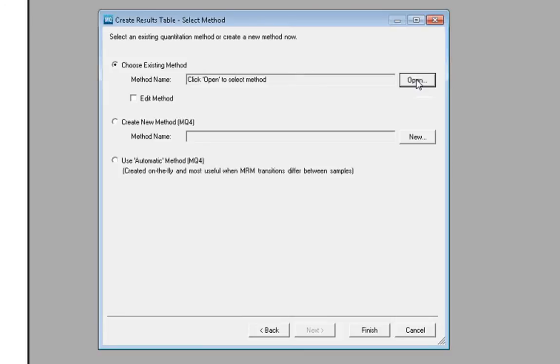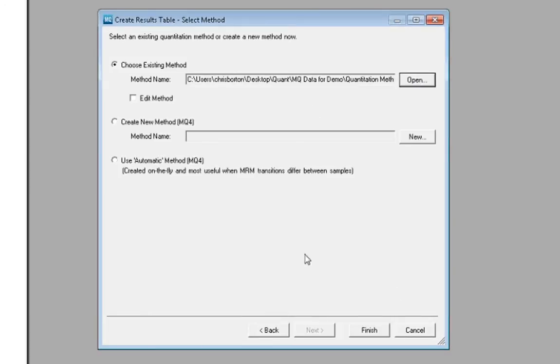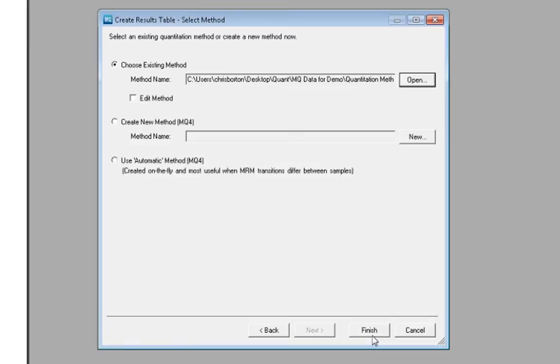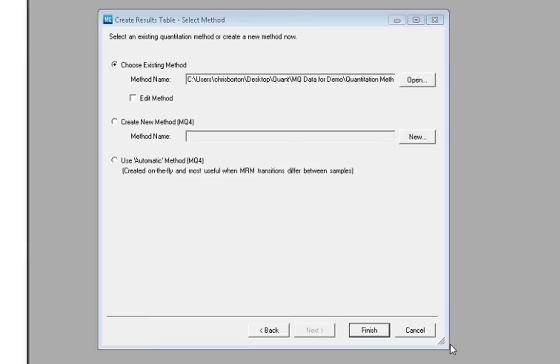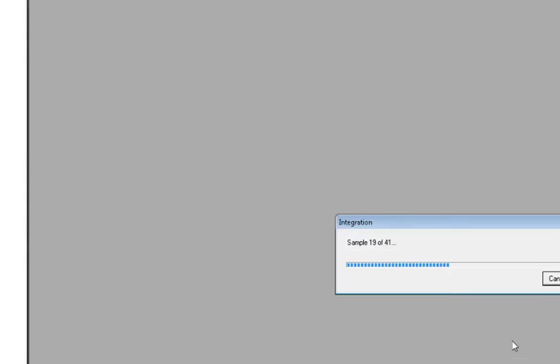We select Next, then we are able to browse our computer for the quantitation method. In this example, we are using a quantitation method that we've previously created. Once that method is selected, we click Finish. The software is then applying the quantitation method to integrate all of the chromatograms in our sample set.